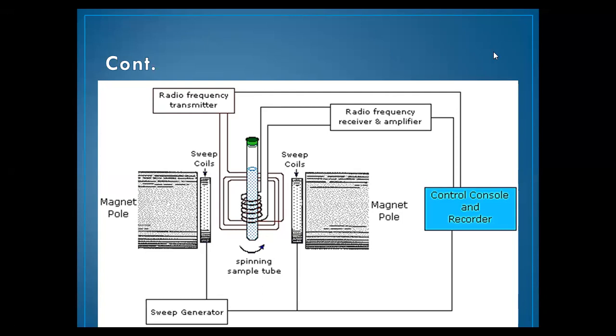We can also use a sample probe to fix the sample in the sample holder. The resonance frequency of an atom or a molecule is changed by the internal molecular magnetic field surrounding it. So if we change the homogeneous magnetic field into a heterogeneous magnetic field, then the resonance frequency of an atom or a molecule will also change. So the resonance frequency gives details of a molecule, its individual functional groups and its electronic structure.